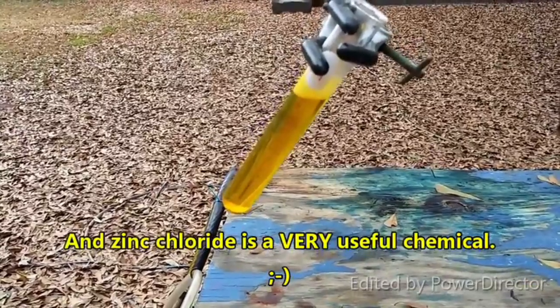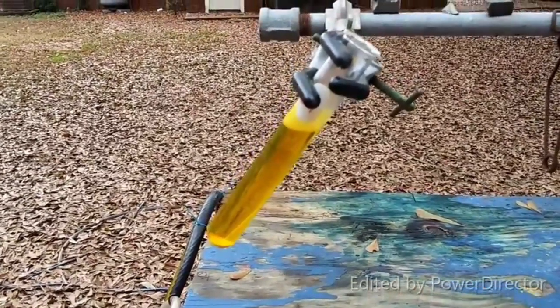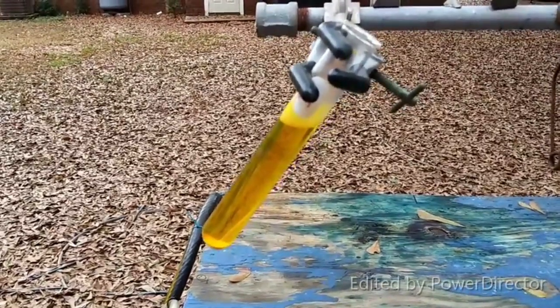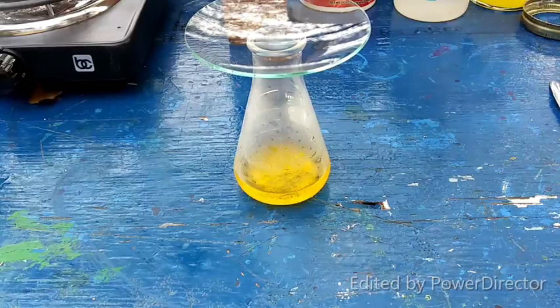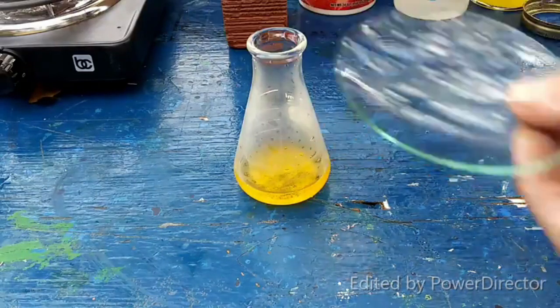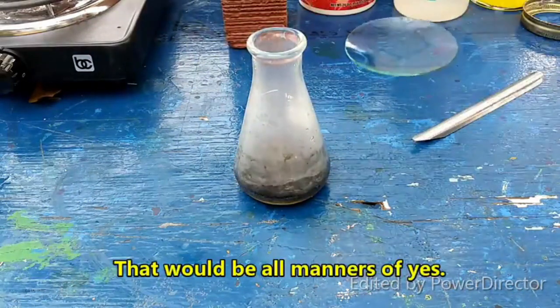Anyhow, I'm going to try getting a little bit of this into a small beaker, and we're going to test a little borohydride on it and see if that doesn't reduce it a lot faster. So, here we go, y'all. Moment of truth. Can this stuff be reduced with sodium borohydride? Sure looks like it.